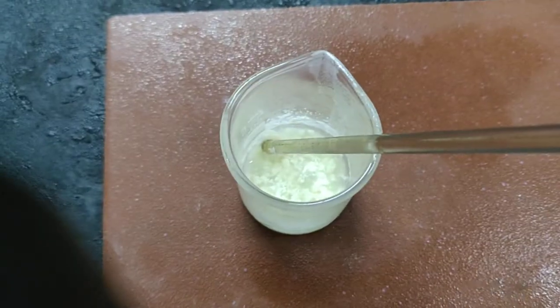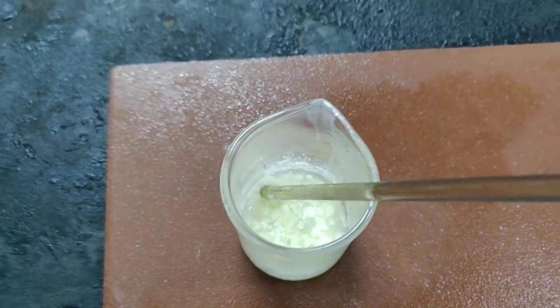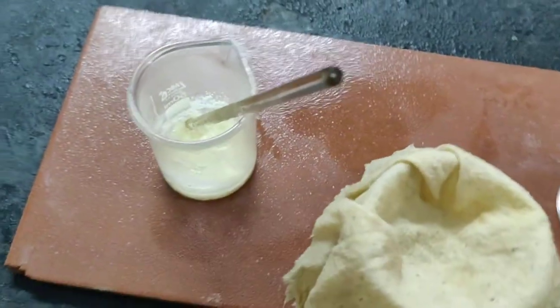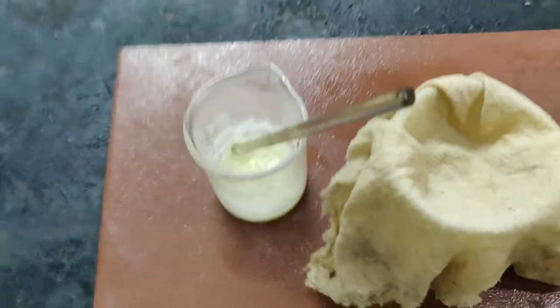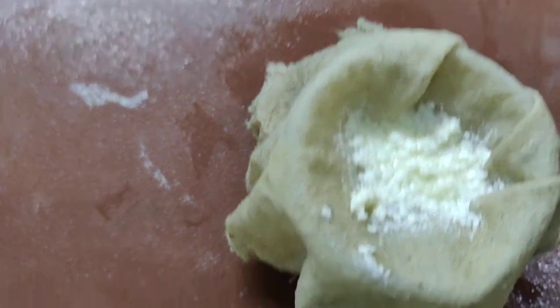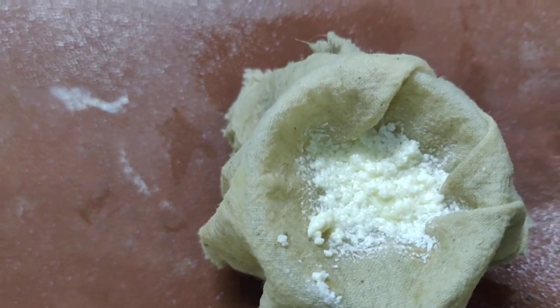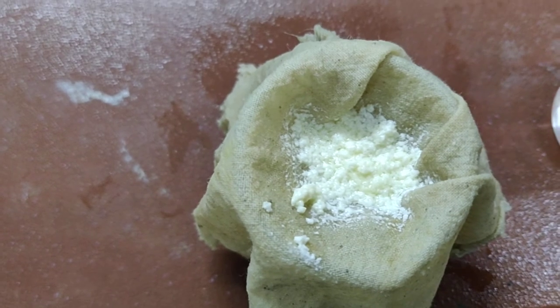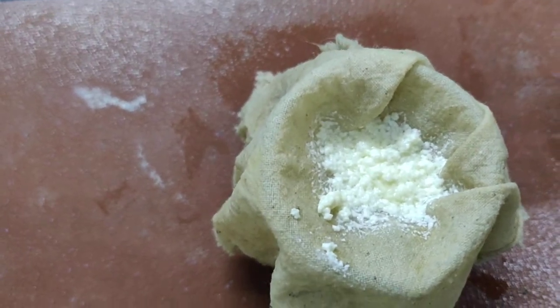So the next step is filtration. We are supposed to filter it. I have a muslin cloth here. We are going to filter it into it. Transfer the curdled milk into muslin cloth like this. Allow it to drain for some time.